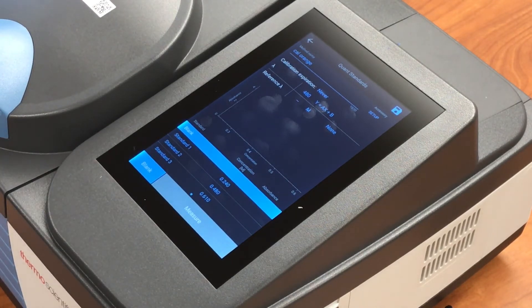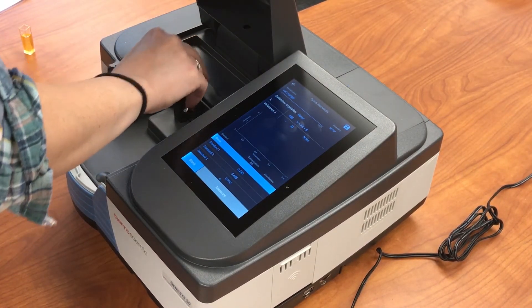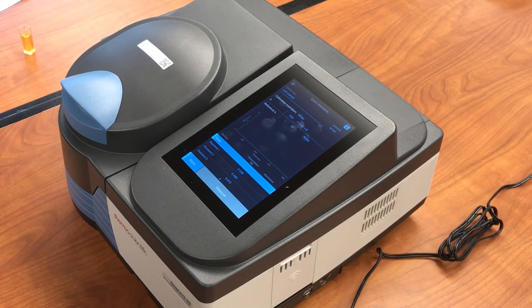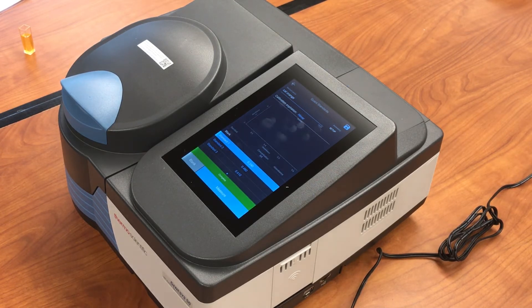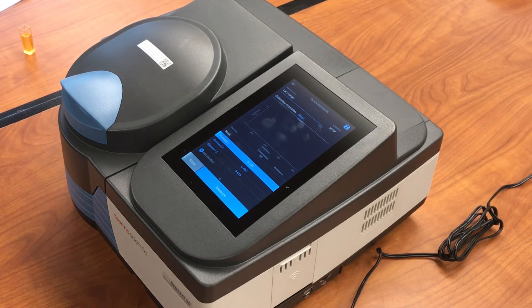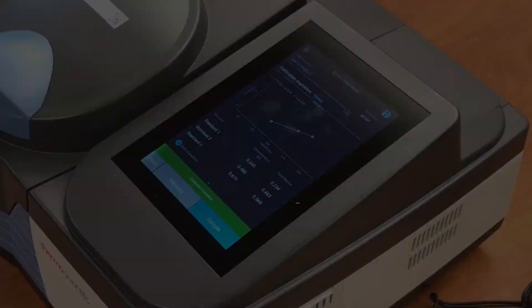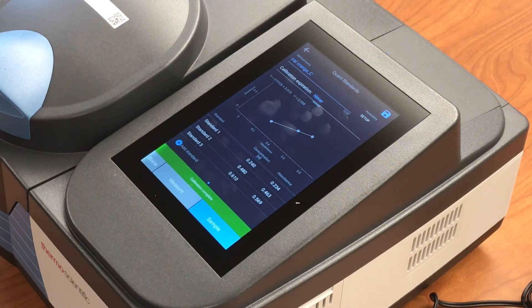The first thing you'll have to do is measure the absorbance of a blank, and then you'll be asked to measure the absorbance of each of the standards. So I've now put the blank inside the instrument. I'm going to touch blank. It has measured the absorbance of the blank at 480 nanometers. You'll notice that this measurement was much faster than the scan that we did, and that's because we're simply measuring the absorbance at only one wavelength, as opposed to many different wavelengths. You would then place the cuvettes containing each of the standards in the instrument and measure their absorbance. At this point, I've measured the absorbance of all of the standards at 480 nanometers.